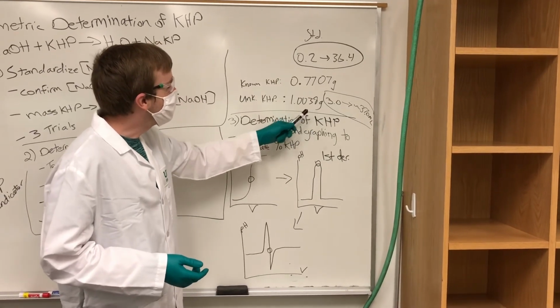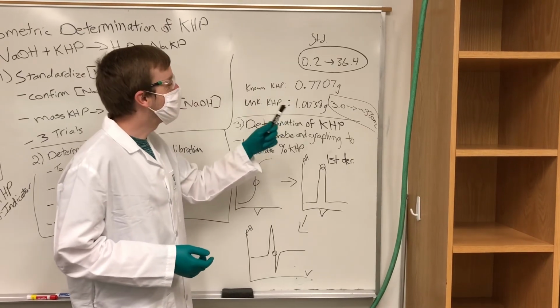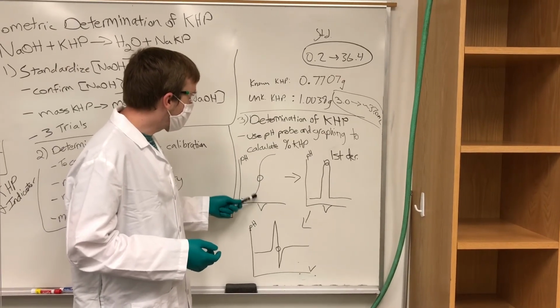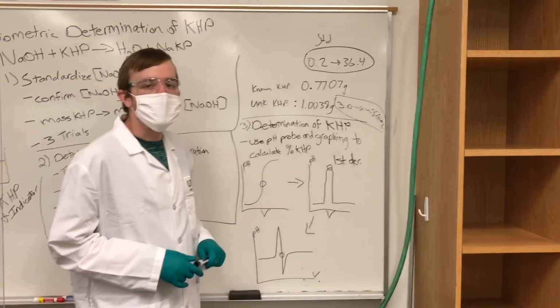You can use the data from the volume-dependent measurements that we've just completed in the video to plot your pH versus volume curves and also get the first and second derivatives for your calculations. Thank you.